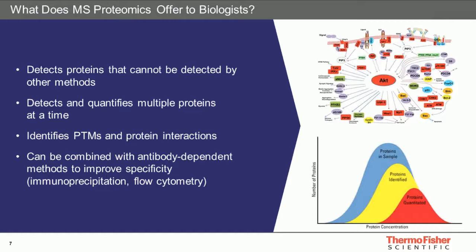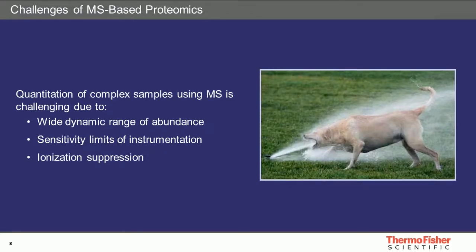as a mass spec detector. So as we discussed, mass spectrometry is an unbiased detector with many benefits, one of which is the ability to observe a wide range of targets. In fact, so many targets that many researchers can feel overwhelmed by the amount of information they obtain from mass spectrometry. But we also need to consider the particular constraints of our experiments. While mass spectrometry can observe a wide range of protein abundance, some of the natural protein abundance of biological targets is much lower than what can be detected by the mass spectrometry analyzer.